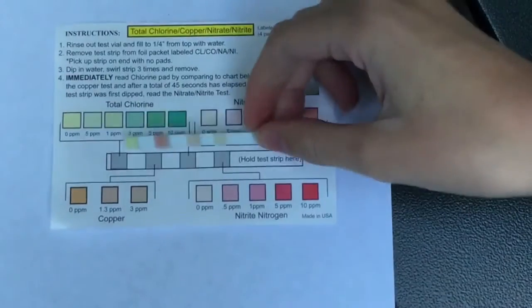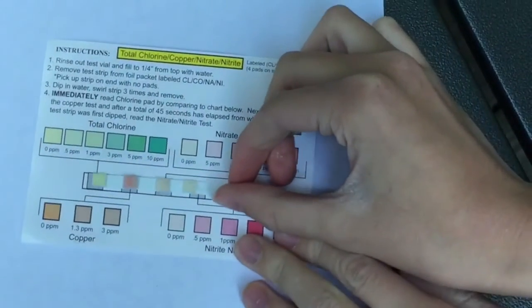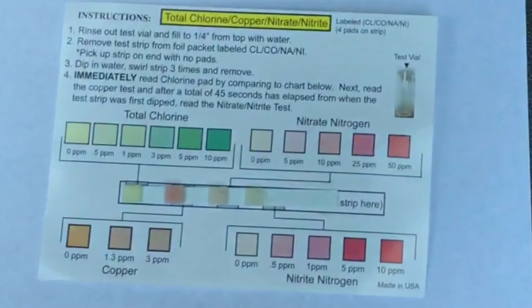So here we have our test strip — it's been 45 seconds. First is chlorine: looks like we have about 0.5 parts per million. For copper, about 1.3 parts per million. The third one is nitrate, and it looks like we have about 5 parts per million — it's hard to tell. And the last one, nitrite, looks like we have about 0 parts per million.